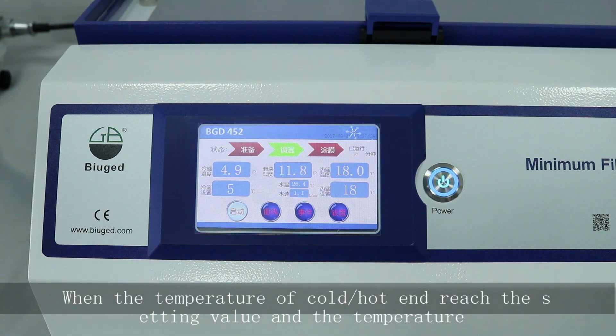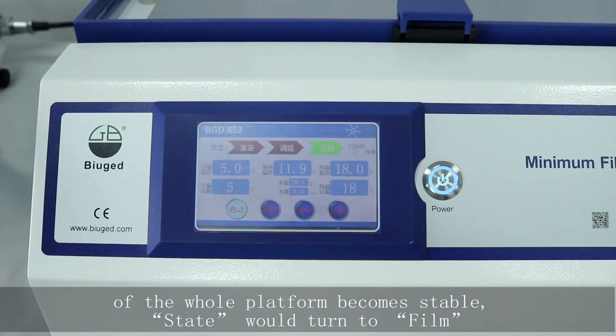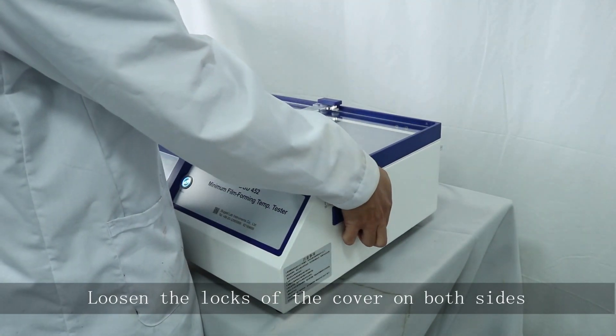When the temperature of the cold or hot end reaches the set value and the temperature of the whole platform becomes stable, the state will turn to film. Loosen the locks of the cover on both sides.